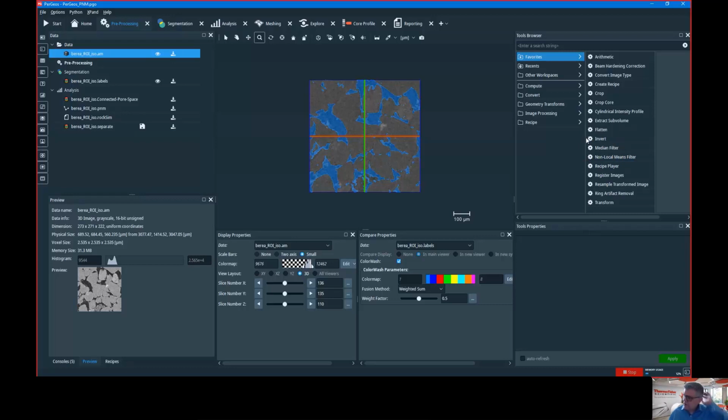So in a way, the software tries to guide you more than Avizo. You are more constrained in this. Since you are in this step, you will focus on something rather than other things. That's another part of the philosophy. You see immediately PerGeos is more oriented to a little bit more industrial use, while Avizo is more oriented to basically any generic use.